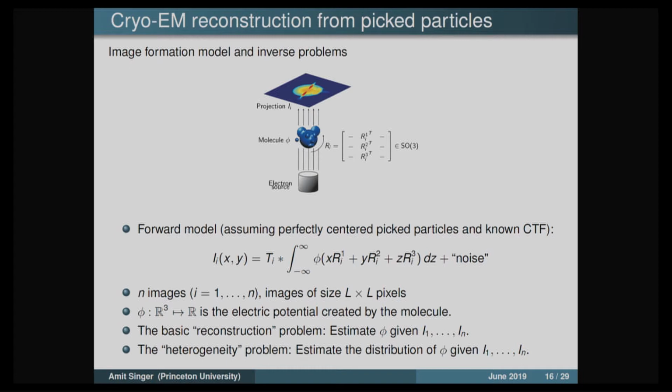So I have maybe 3 minutes? Yes, exactly. 3 minutes, OK. So in 3 minutes, I'll try to give an idea how you can do autocorrelation analysis to solve CryoEM.